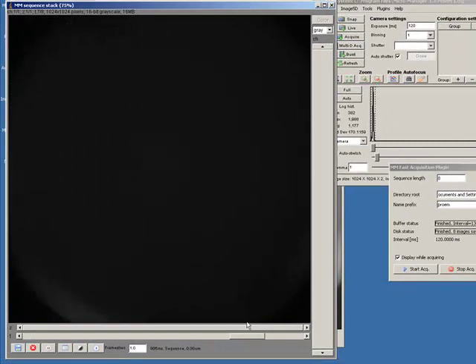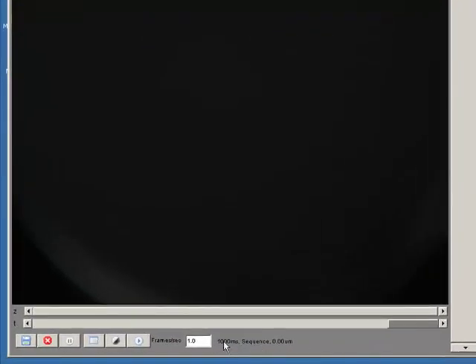As we play along, as I said, we're going to expect about a second's worth of data, because I say the camera goes at about 8 frames a second, which is excellent. I hope that helps.